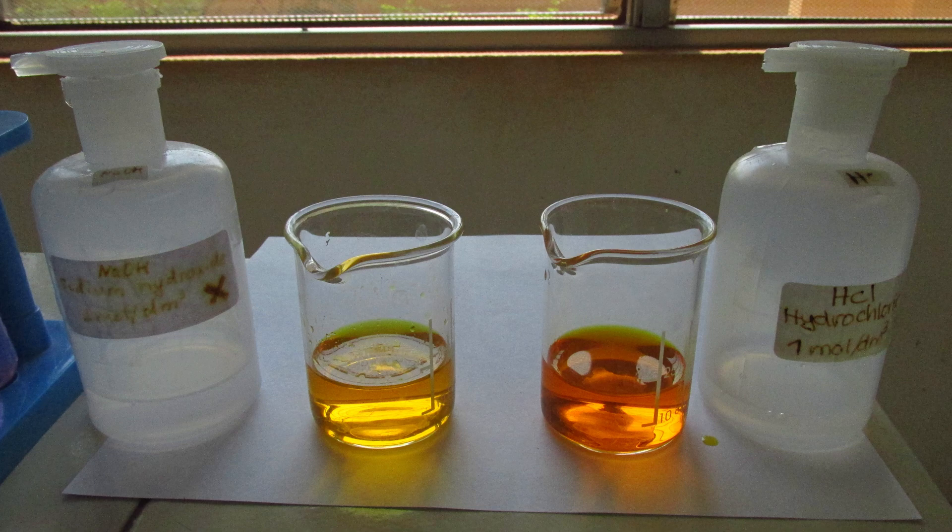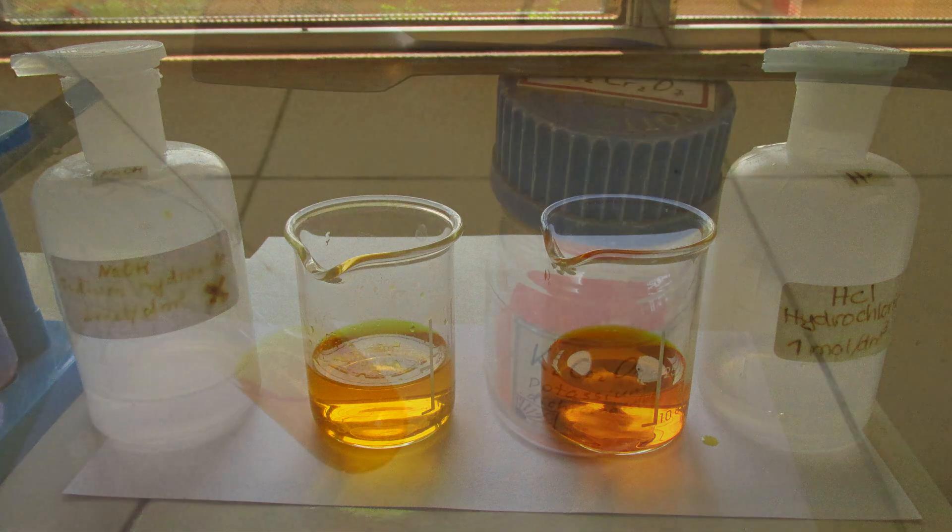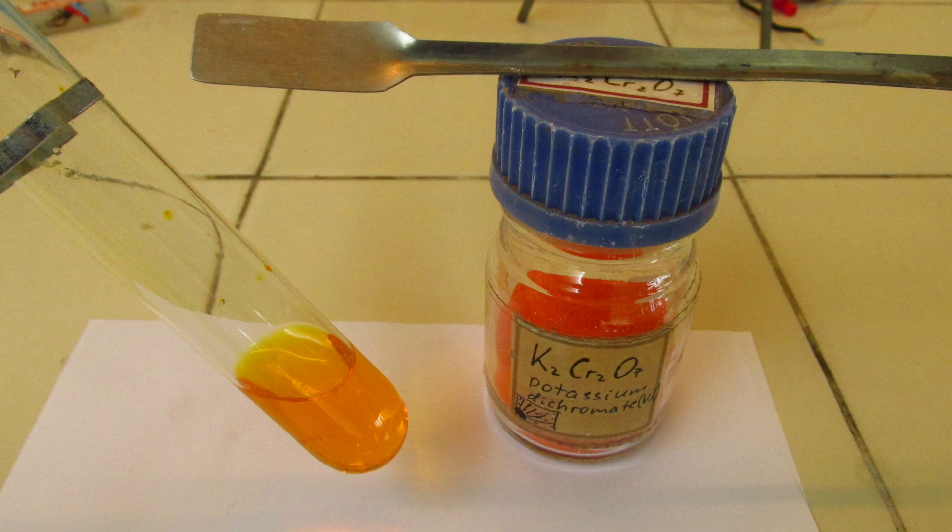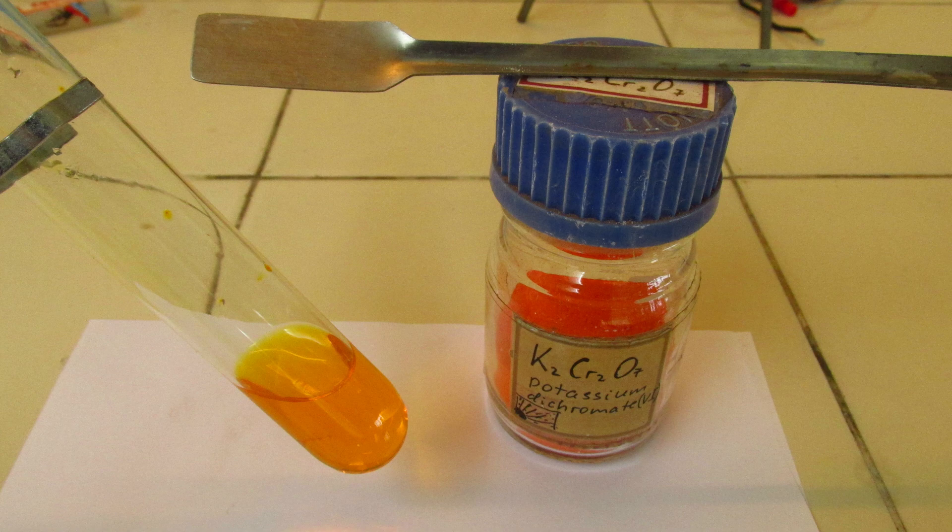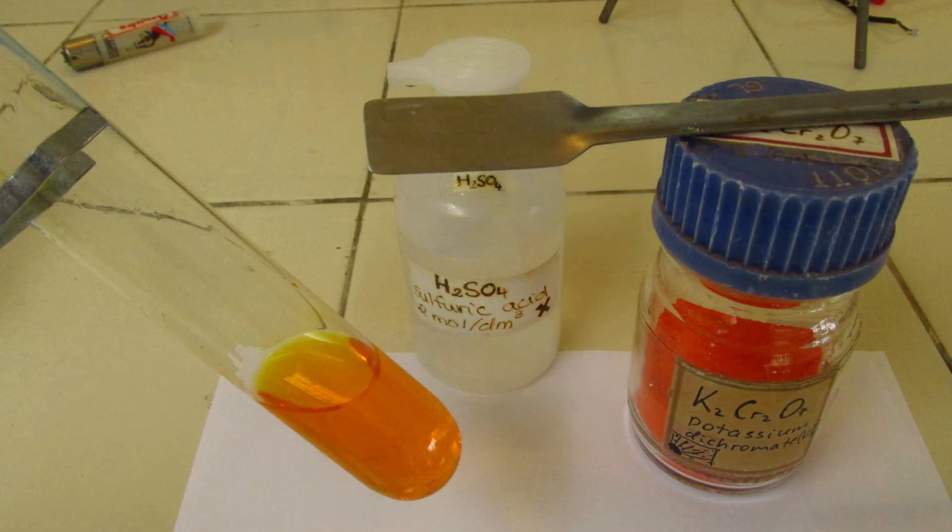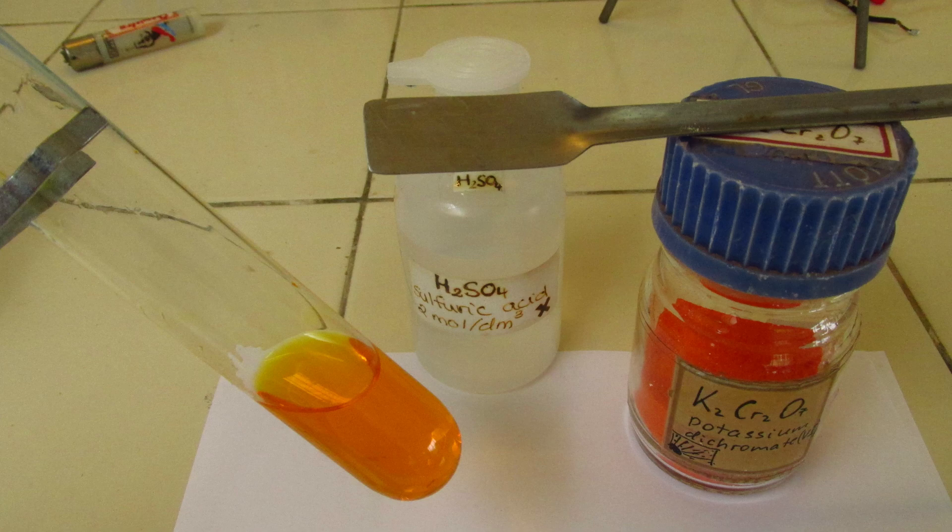But essentially we need acidified solution of potassium dichromate, because that's a pretty famous oxidizing agent, and we use it in many tests. So here I prepared it, acidified it with sulfuric acid, and now I'm trying to add some reducing agent to it and see what happens.